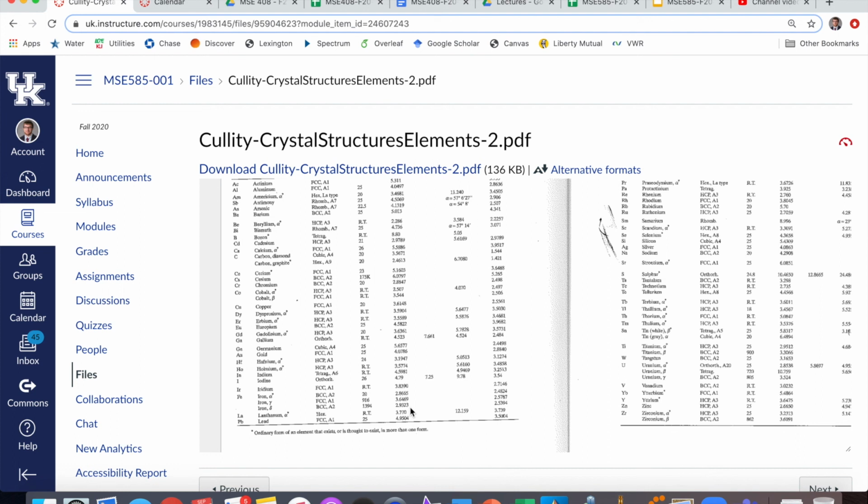So you might have multiple close matches, and you want to look at which one is the closest in this case. So that's just going through an example of how we could index a pattern with this simple method, and then if it's an element, use this table to cross-reference those values to see how close we are.